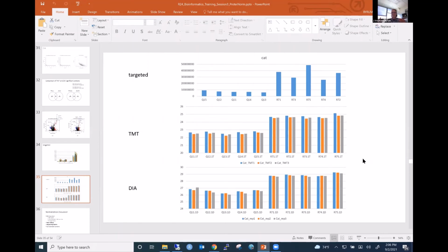It's when you're trying to get to those ones that are on the edge of your significance that you really want to take a little more time, look into the peptides. What did we actually identify? That's where it can start becoming time consuming, and you really need to know more of what your biological story is.